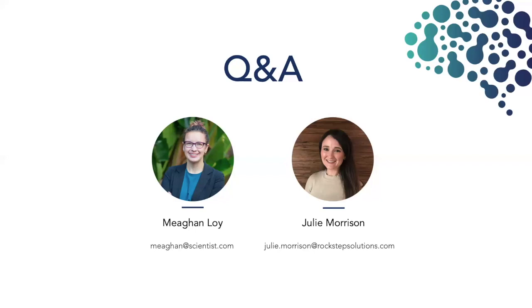Yeah, for sure. So similar to what I just mentioned with creating your data outputs to be whatever you want them to be. So I don't know if it was an ELISA coming back, you might have a column for the well position and then each of their different concentrations. You can also create really anything you want. So it can be body weight. It's a pretty flexible platform, so it can work across different therapeutic areas, different tasks. So the short answer is yes.